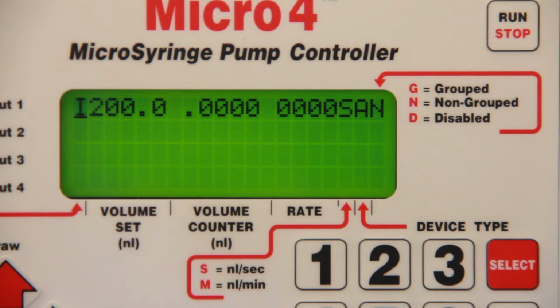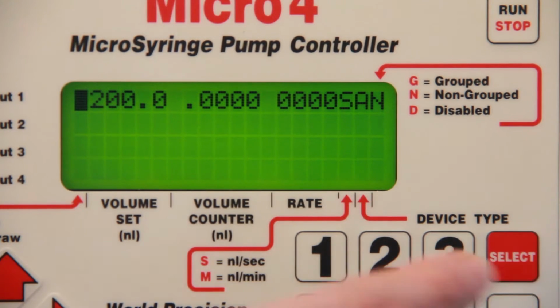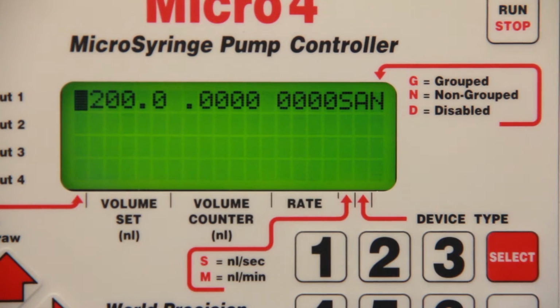Now move the cursor to the far left field. With the cursor in this field, pressing the Select button toggles between W for the withdrawal mode and I for infuse mode. Since our syringe is already filled, we'll set the Micro4 for infuse mode.